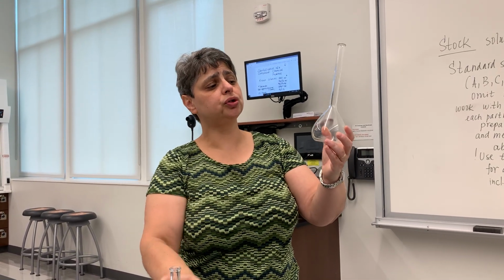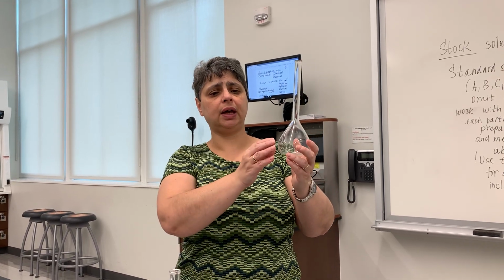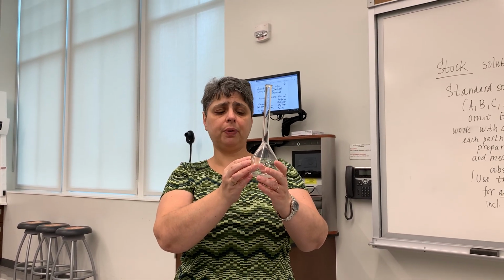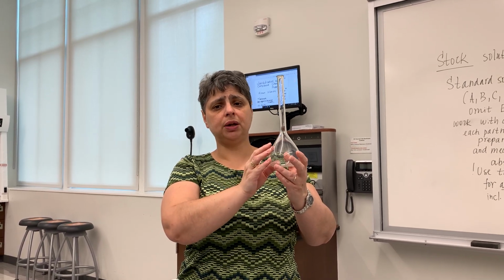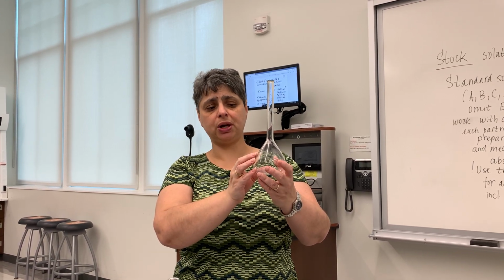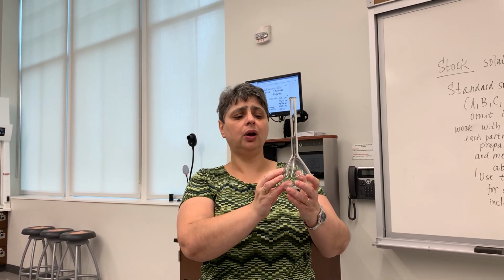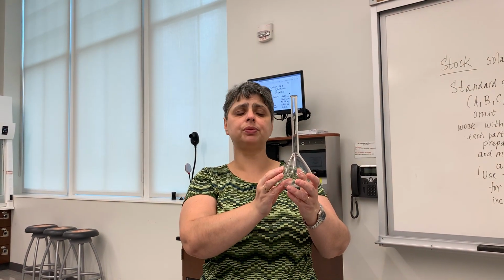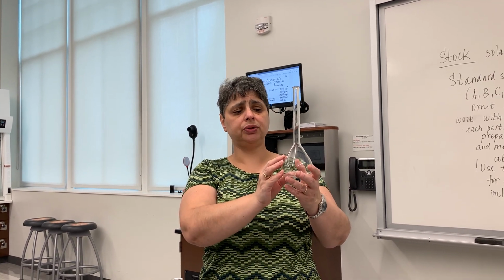One thing that you should be concerned with, and maybe consult with your TA about, is the fact that the tablet contains a starch binder to keep all the ingredients from falling apart. And starch is not soluble in water, and so this solution here may be cloudy. If it's cloudy, the cloudiness will interfere with your absorbance measurements. It will cause you to have extremely high absorbance, because light will scatter on the solid particles and will not reach the light detector, which will be read as high absorbance. So if the solution happens to be cloudy, like I said, consult with your TA.